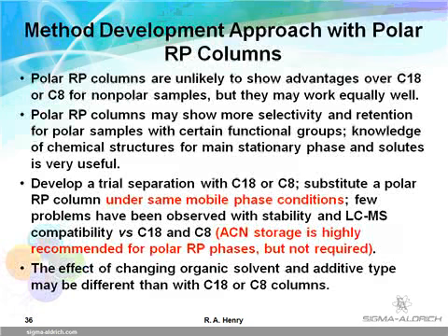This greatly speeds up method development and allows simple, convenient automation of the separation process. We prefer acetonitrile storage, especially for polar RP columns, because it is a less reactive environment toward silica than either water or water-methanol mixtures. We also recommend that methanol be explored as the organic component or as a co-solvent with acetonitrile when polar RP phases are employed.